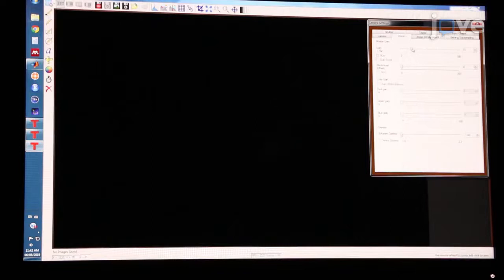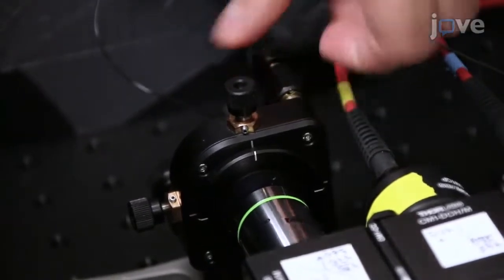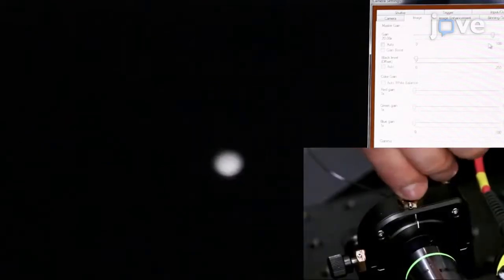Increase the gain or adjust the lookup table until the image is visible at the focal point of the objective. Advance the 5-axis translator towards the objective, ensuring that the 470 nm light is centered on the fiber at the SMA or FC end of the patch cord until an image can be resolved on the camera. Finally, adjust the X and Y axes until the image is centered and well resolved. Visualize the light emitted from the ferrule end of the patch cord, as it should appear as an isotropic circle.